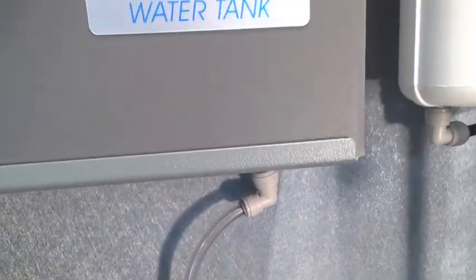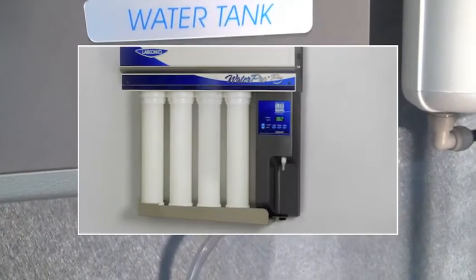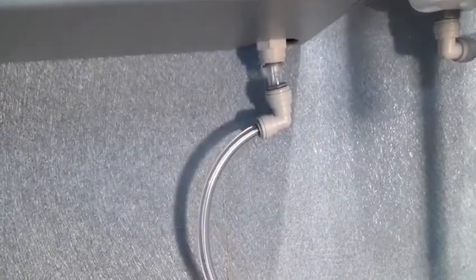An outlet port on the integral 17-liter storage tank provides for connection to a WaterPro PS polishing system or a LabConco glassware washer. RO water is delivered through a user-supplied connection tube.